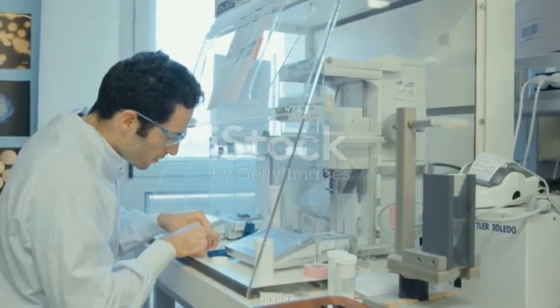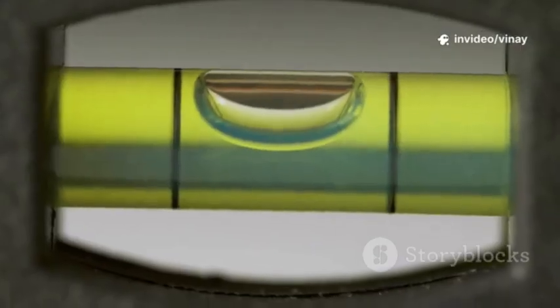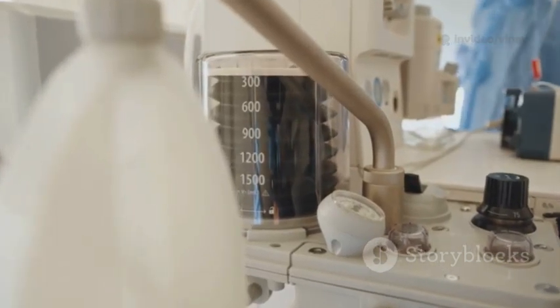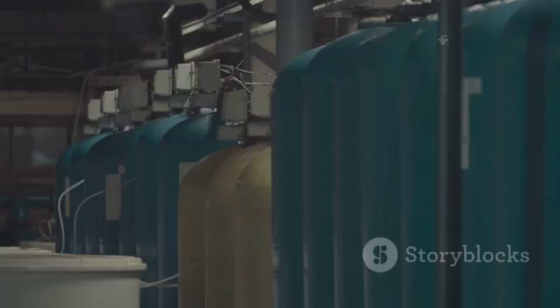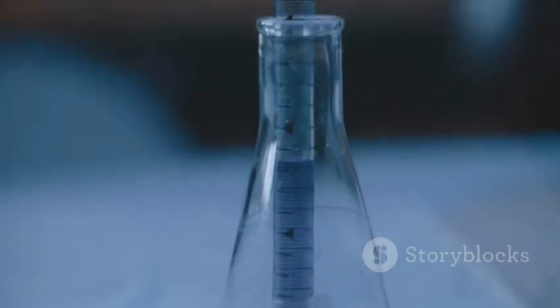The forward flow test is another very popular and reliable method for checking filter integrity. It's a bit different from the bubble point test. Instead of looking for the exact pressure that makes bubbles appear, this test measures how much gas moves through the filter at a constant pressure. Just like the bubble point test, we start by completely wetting the filter membrane with a suitable liquid, like purified water. This fills up all the pores and sets the stage for our scientific measurement.